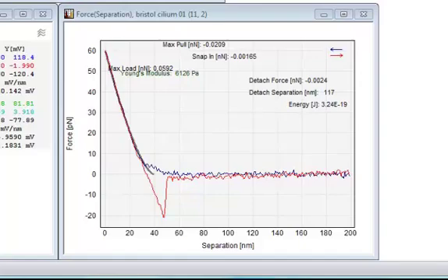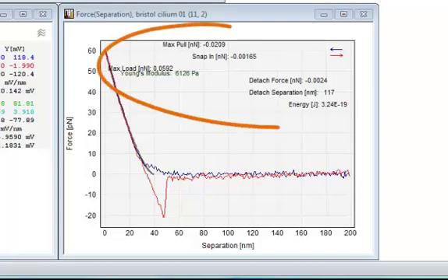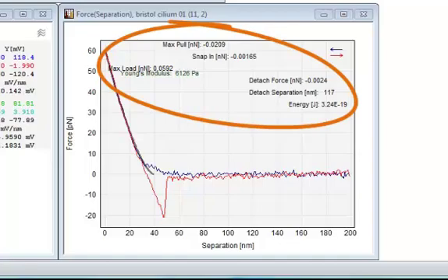In this window, the relevant parameters selected on the general tab are also displayed. In this case, these include the Young's modulus, snap-in, maximum pull, and more.